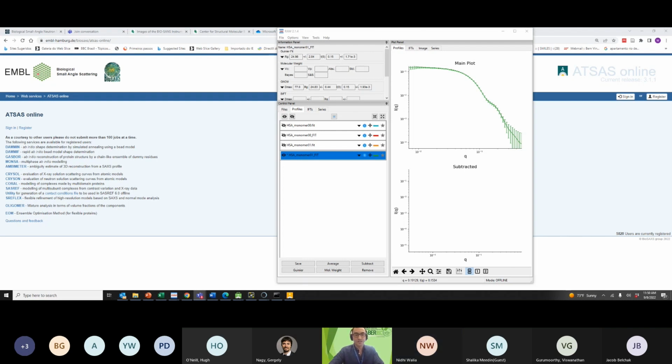In the ideal case, you should not go up again; it should go all the way down. In the small angle scattering region, you should see it goes down, and then you go to a plateau region where you have no scattering. Then for very high angles, in the wide angle, you should see something comes up again, but that is a different effect.